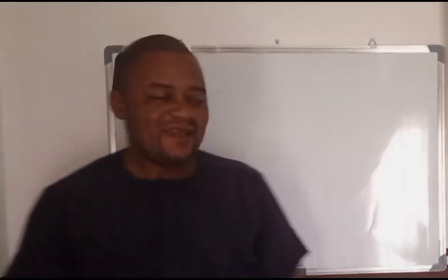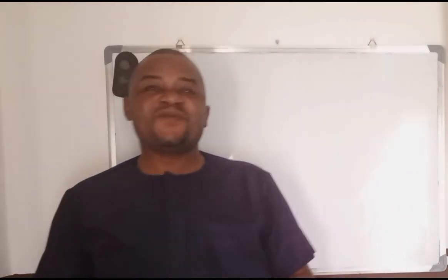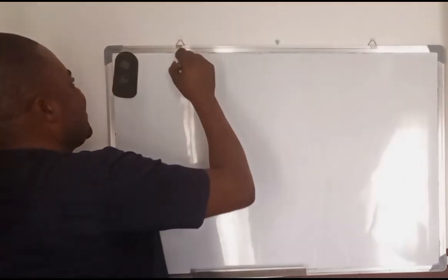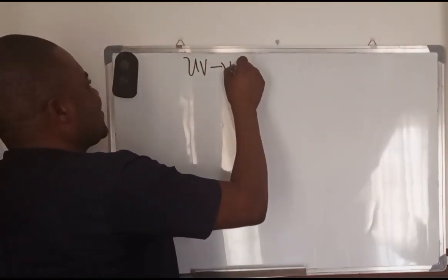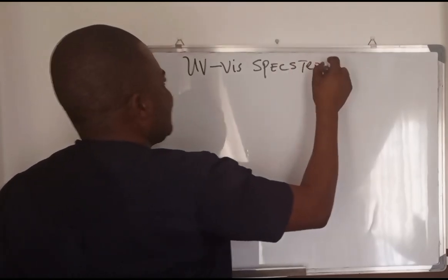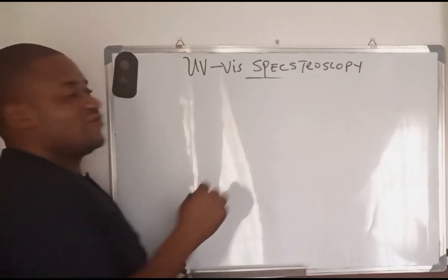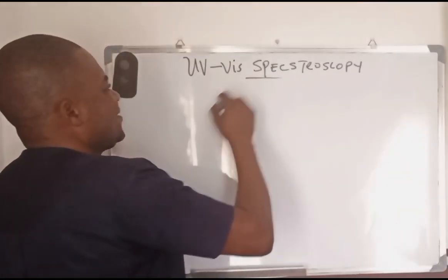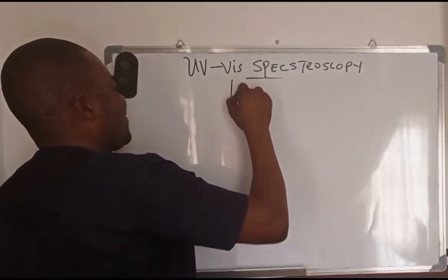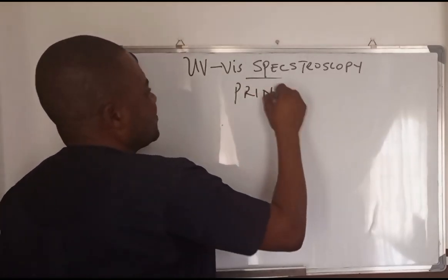Your chemistry teacher, and today we are going to be discussing UV visible spectroscopy. That is what we are going to be seeing today, and we are going to be concentrating on the principle. Let's look at the principle.